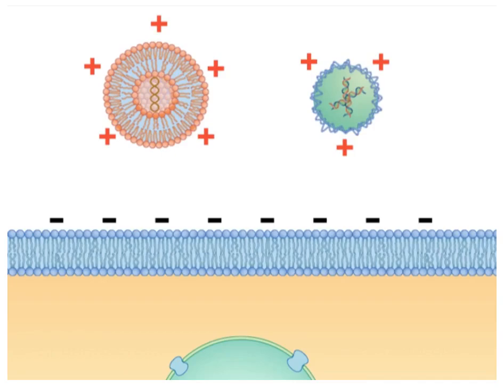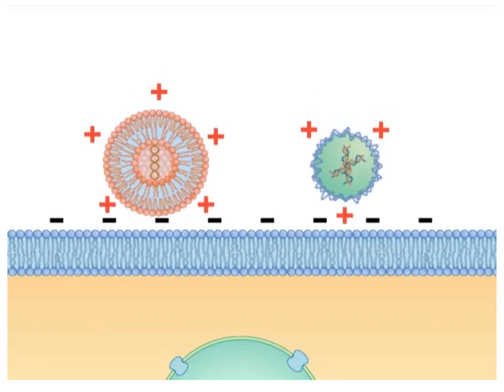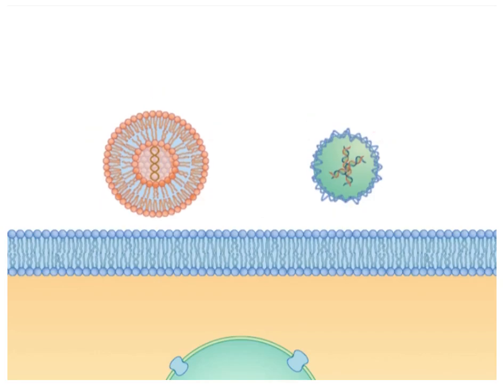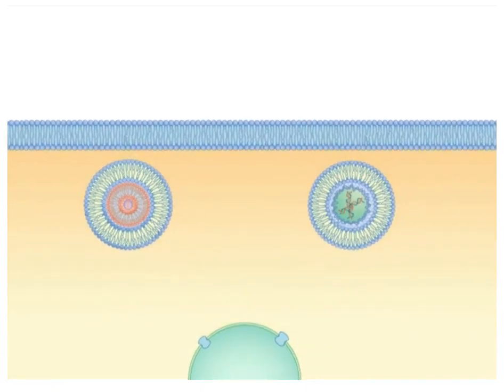The next step in chemical-mediated transfection is attachment of the positively charged complexes to the negatively charged cell membrane through simple electrostatic attraction. Then, the complex enters the cell via endocytosis, a process by which molecules enter the cell via membrane-bound vesicles called endosomes. Once inside the cell, the nucleic acids must escape from the endosome by a process that is still unknown. Once outside the endosome, the nucleic acids will find themselves in the cell's cytoplasm and then ultimately the nucleus, where the cell's machinery is able to make mRNA and then protein from it.